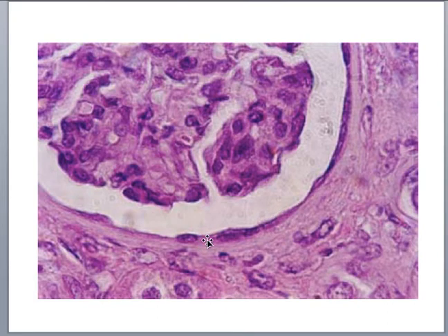And you can really see that flattened, squished cell, another flattened, squished cell. This would be a nucleus of one cell, a nucleus of another, a nucleus of another. So a single layer of flattened cells. This is simple squamous epithelium in the kidney.